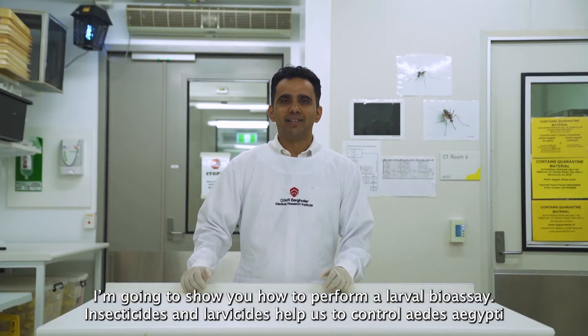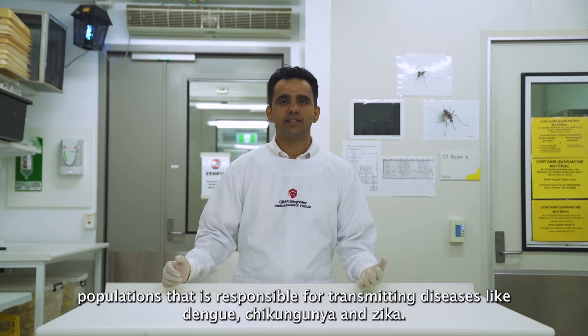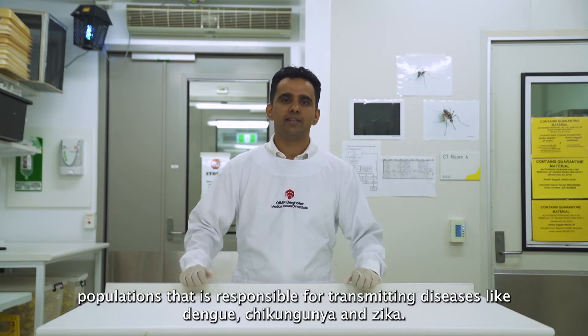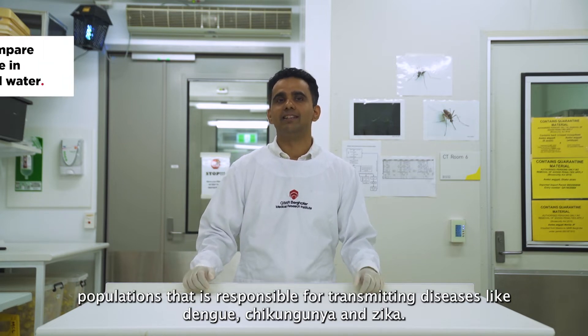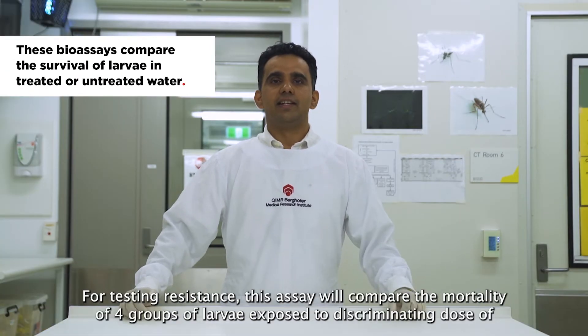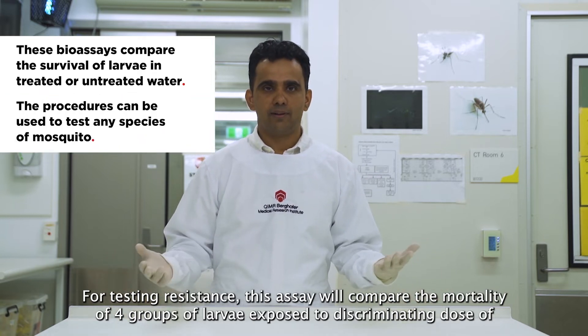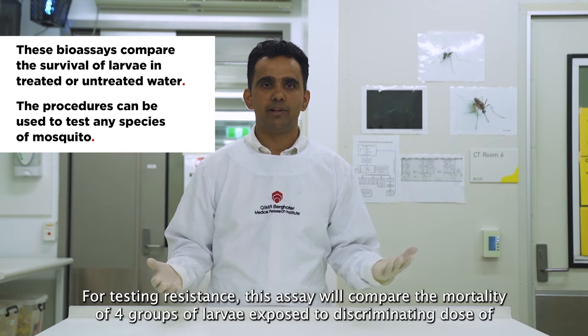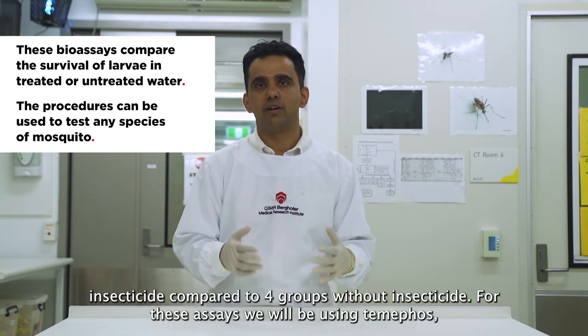Insecticides and larvicides help us to control Aedes aegypti populations, which are responsible for transmitting diseases like dengue, chikungunya, and Zika. For testing resistance, these assays will compare the mortality of four groups of larvae exposed to a discriminating dose of insecticide compared to four groups without insecticide.